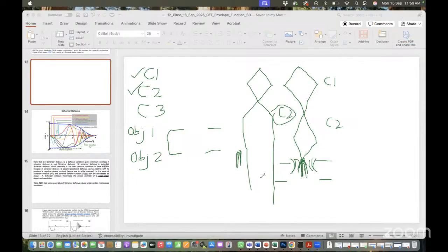Okay, is it so clear, Karthik? Just recapping, the role of the C1 lens is basically to use a strong magnetic field, so that the spread of the beam is large, so that a lot of the electrons will not go through to the C2 lens. Like for imaging biological specimens, we need to keep the dose low, right?